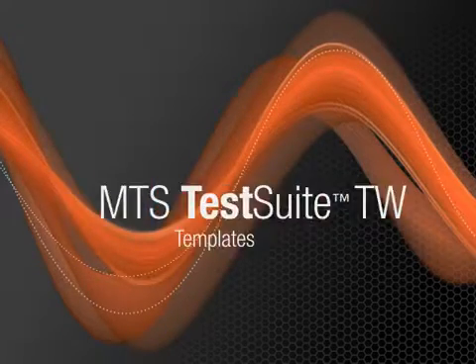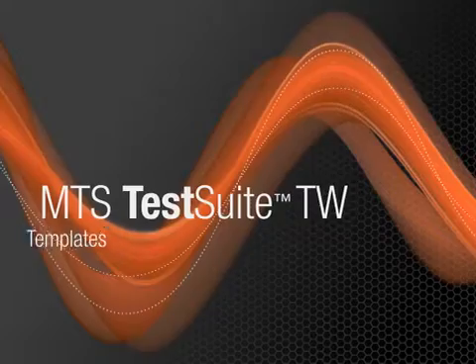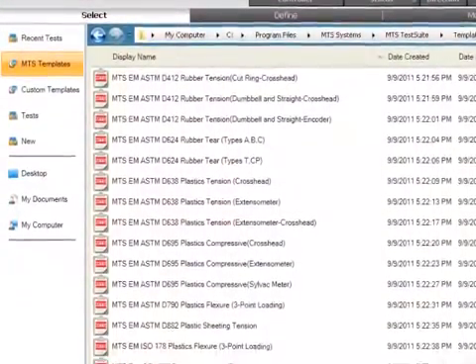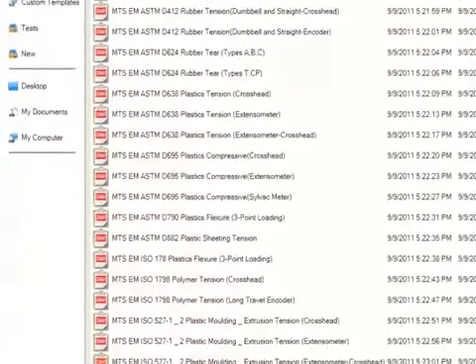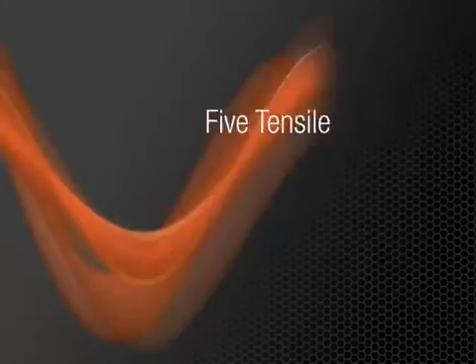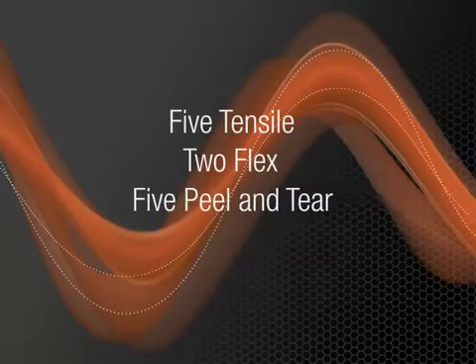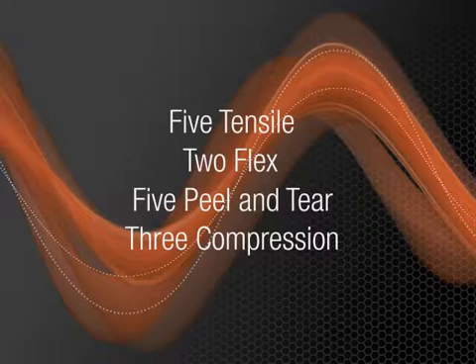MTS Test Suite TW templates provide an array of solutions to meet all levels of testing complexity, from the very simple to the highly challenging. 15 base templates are included with the Elite and Express applications: 5 Tensile, 2 Flex, 5 Peel and Tear, and 3 Compression.